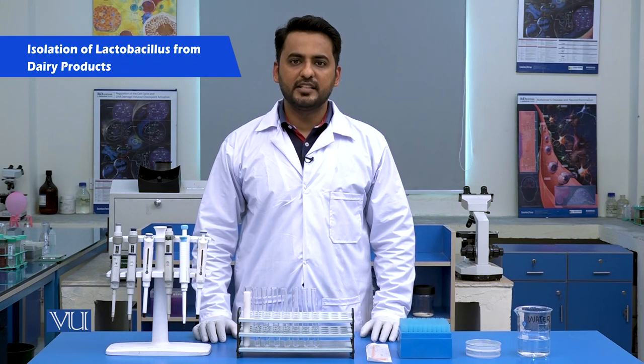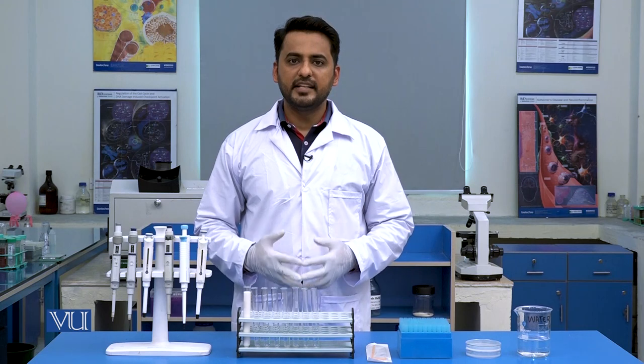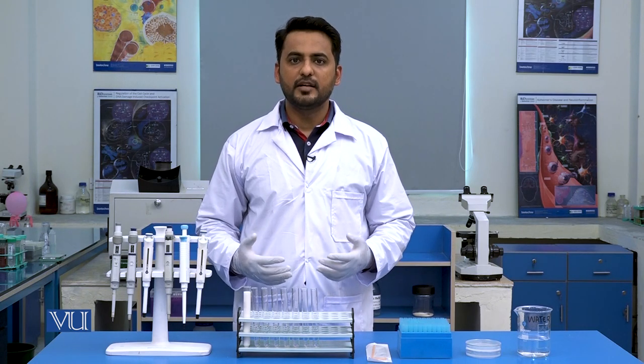Dear student, my name is Mohammed Asjad, and today we are going to perform an experiment named isolation of Lactobacillus from dairy product. In order to perform this experiment, let me introduce you to the materials, apparatus and chemicals which we will use.